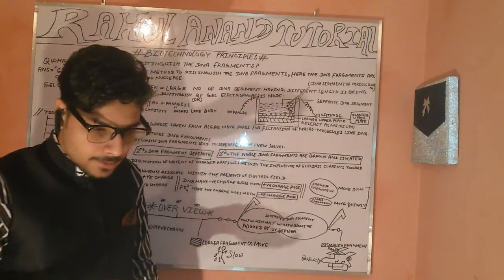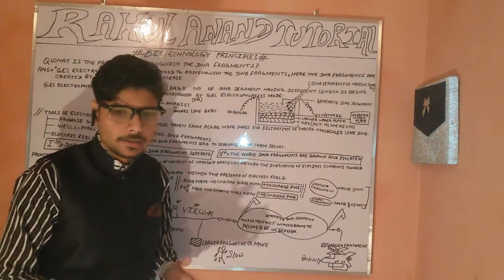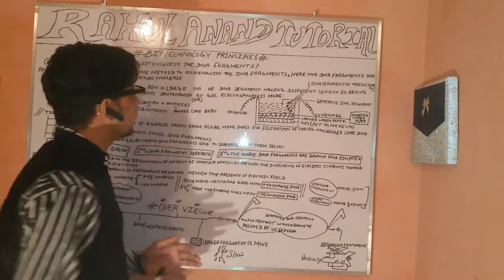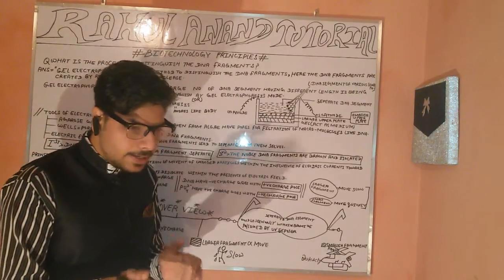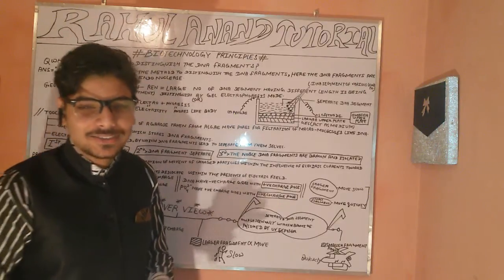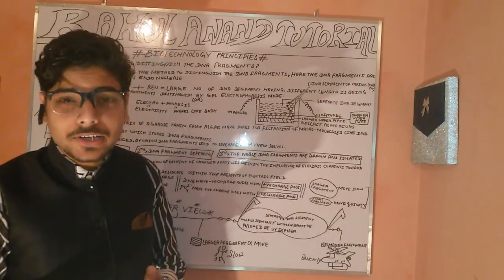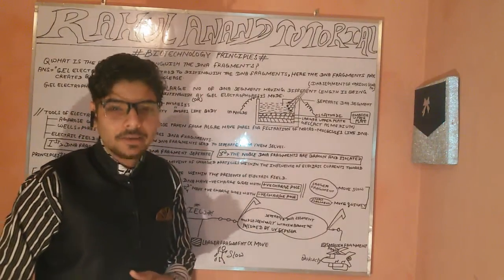As you know, what does DNA fragmentation actually mean? What is the process of the separation of DNA fragments? Let's talk about these. How are the DNA fragments distributed? For that we primarily have the electrophoresis technique. The electrophoresis method plays an important role in the separation of the DNA fragments.